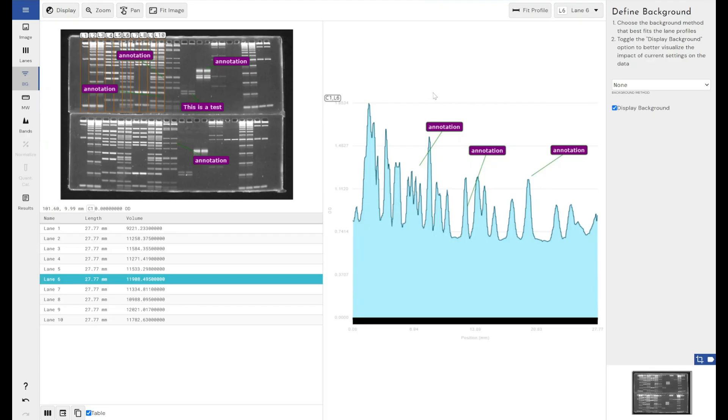So yeah, that is the annotations mode that we've now built into Alpharetix 1D. You can annotate your image, you can annotate your data, you can annotate both, neither, whatever. It's up to you, but you've got all the tools to do that now.